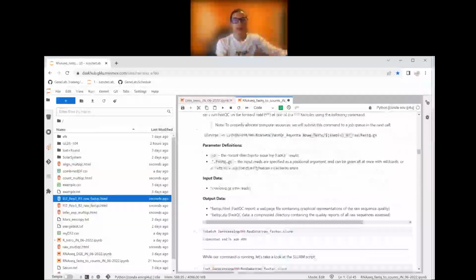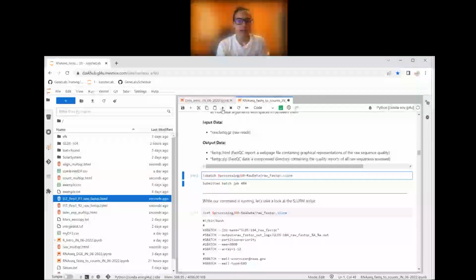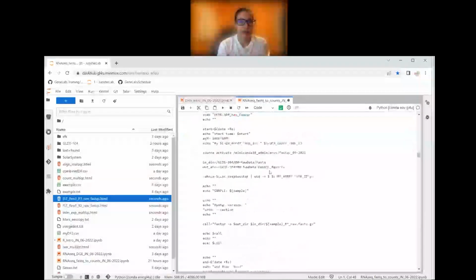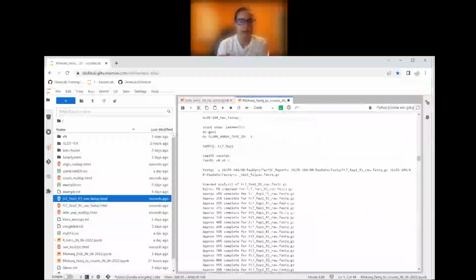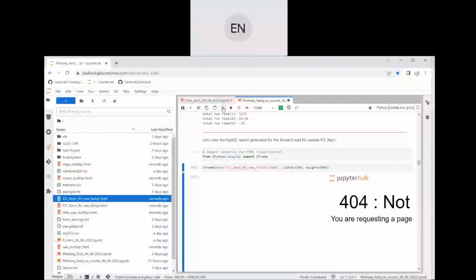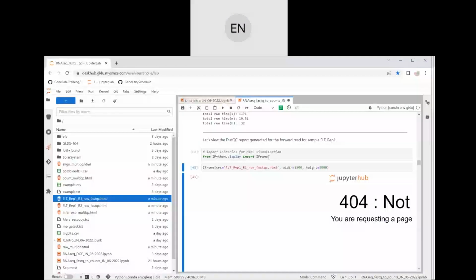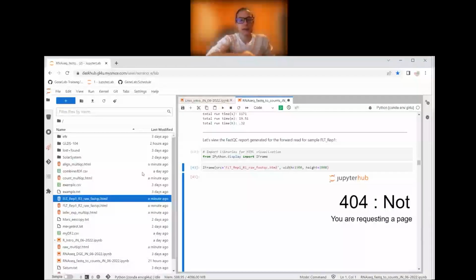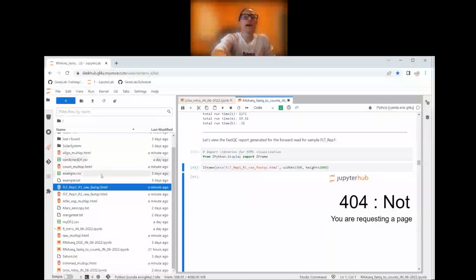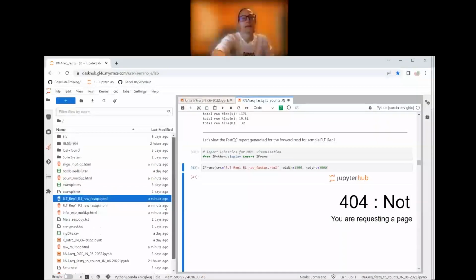Sorry, I think it's important to go through this, because when you guys are teaching this at your home institutions, in case you or your students experience this, you can scroll down and just run the display again. How do I confirm that the iframe is there? It should populate in your cell, where it says 60. If you run it again, that's going to populate probably to 61.